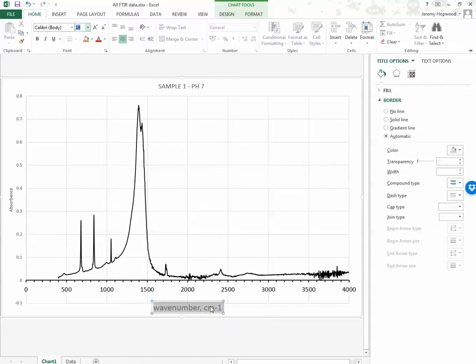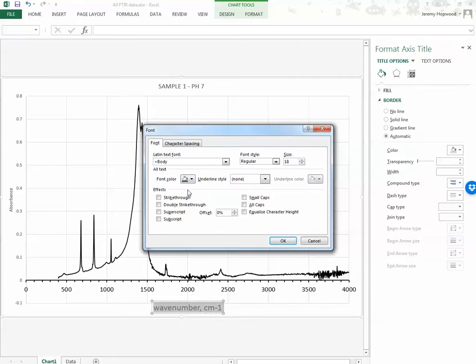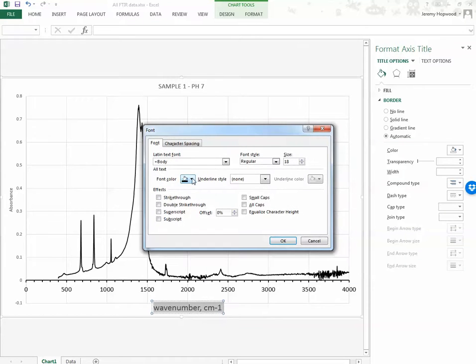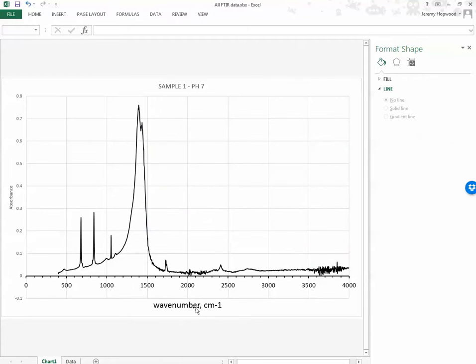So we've got a colour on this, and font colour at the moment is grey, font colour I'm going to make that black and white. So oh no, it didn't like that. Try it again. Font colour, it says it's black and white. Right, it is black. There we go.